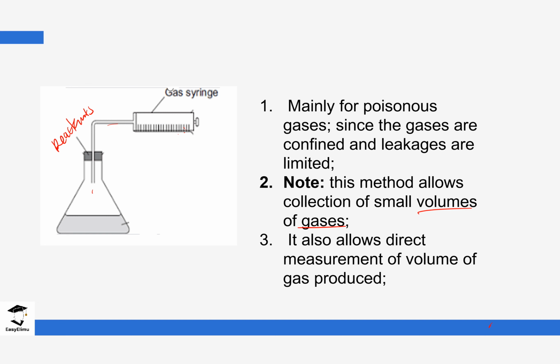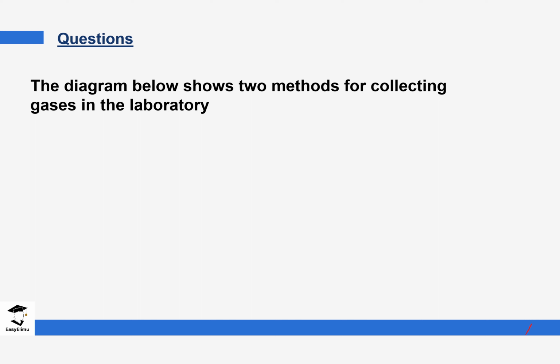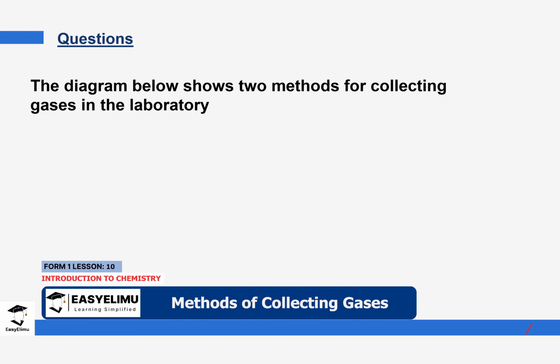Let's look at a few questions in regards to what we have discussed. The first question is, the diagram below shows two methods of collecting gases in the lab.